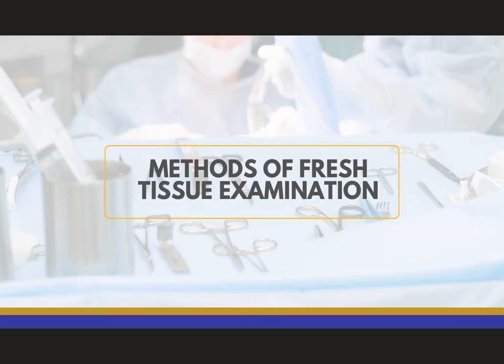Now let's go to the different methods of fresh tissue examination. So please remember that in fresh tissue examination, pwede siyang mag-vary according to the structural and also the chemical components of the cells to be studied, also the nature and the amount of tissue to be evaluated, and the need for an immediate examination of a tissue structure. So this may be done on a fresh and preserved tissue depending upon the necessity. So we basically make the specimen be qualified for testing, and it is hard to reject the specimen.